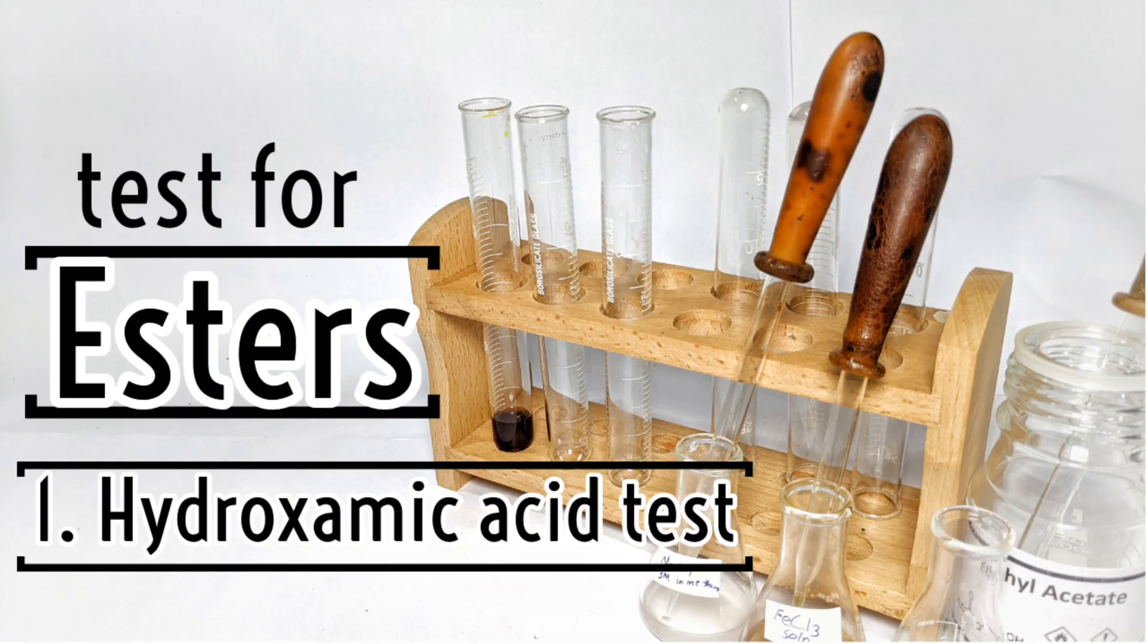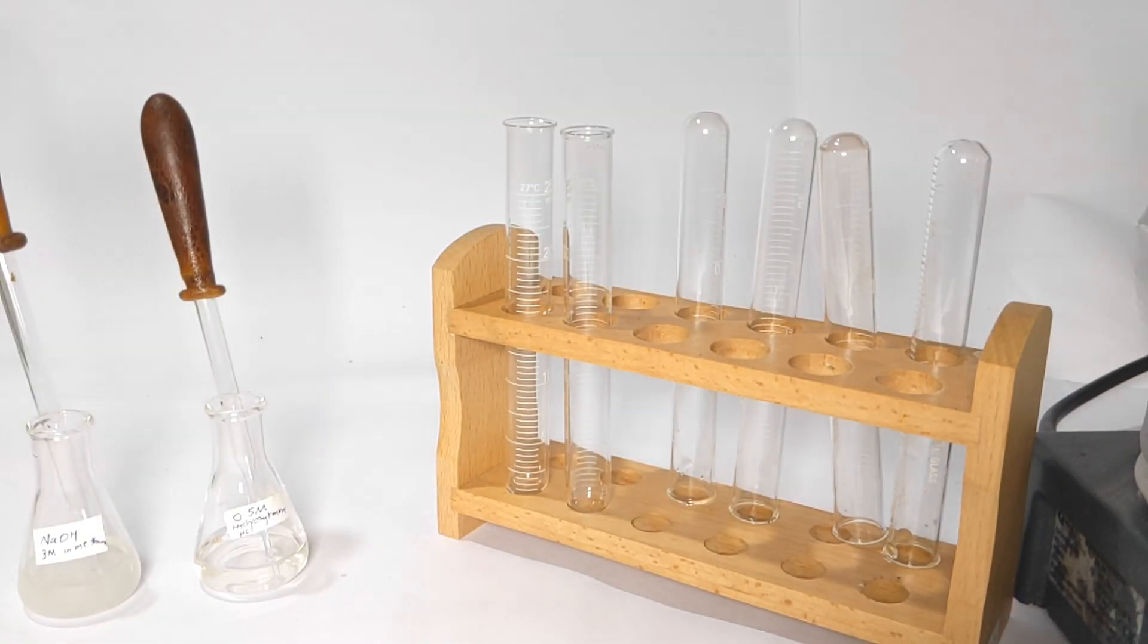Hello friends, in this video we will be performing the hydroxamic acid test for esters.